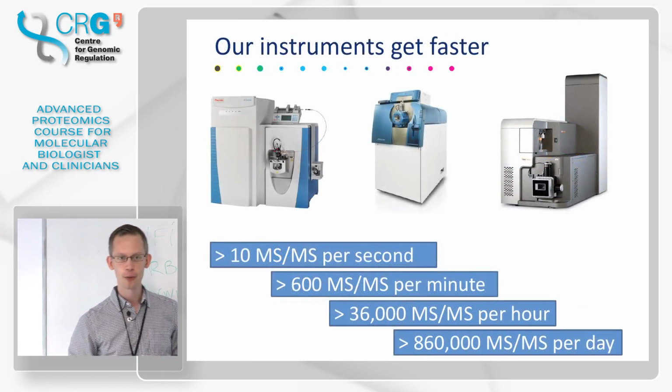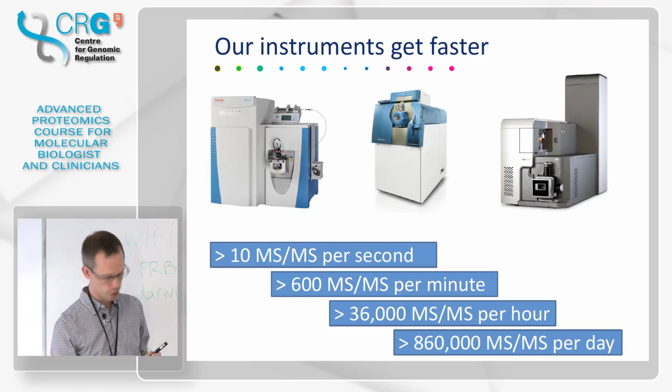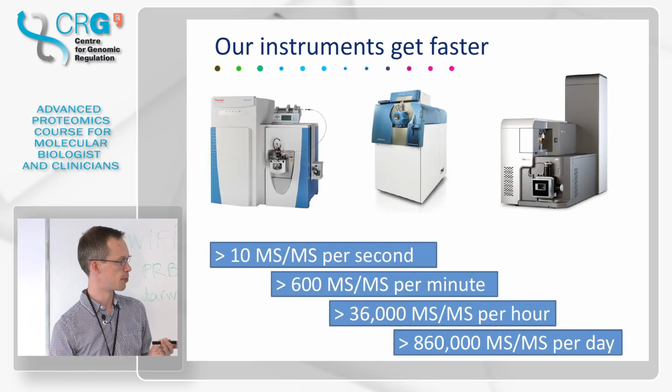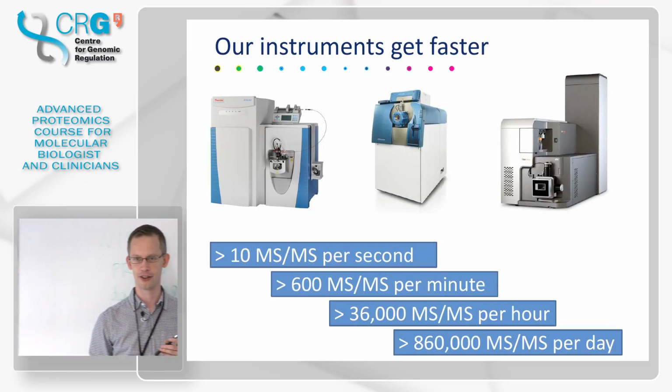On the other side, we have our instruments. I just have three random instruments here, and many of them are actually capable of sequencing. So they generate these spectra that you saw yesterday at very, very high speed. Just doing very basic math, 10 MS/MS per second is more than 600 per minute, more than 36,000 per hour. So we are getting close to a million per day of these spectra.